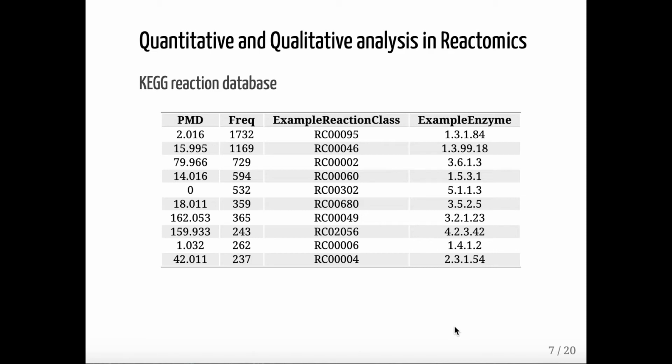So here we see an interesting phenomenon, that the reactions are actually enriched by a few PMDs, which makes it very easy for us to perform quantitative analysis. We do not need to deal with a lot of unknown things. In most cases, if a sample is from a biological system, it will have this enrichment phenomenon, and it can also be linked to some reaction classes or enzymes.